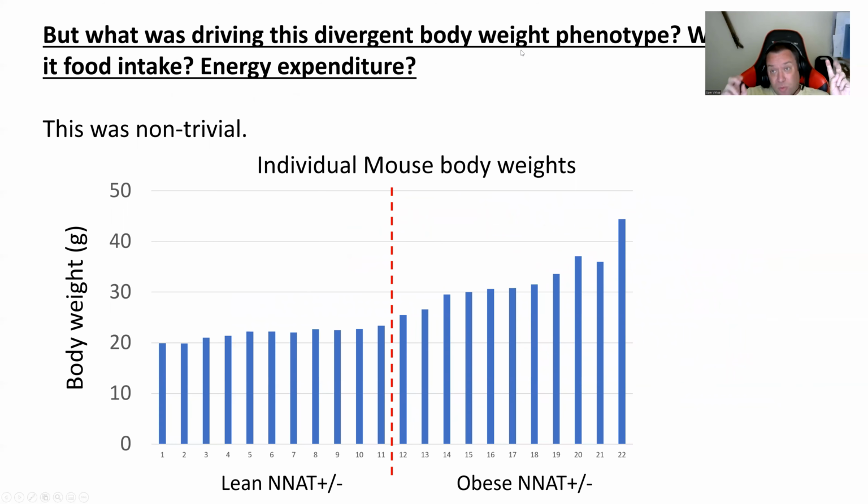Okay, so this was not a trivial question. The reason it's not trivial is we can't genotype these mice, and it's a real pain, so we have to come up with pretty crude ways of doing it. We had two populations based on two previous papers of NNAT plus minus mice, and in this case, the minus is minus P. I should have written minus P.